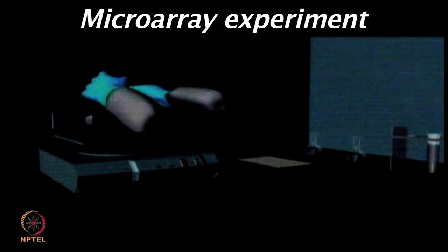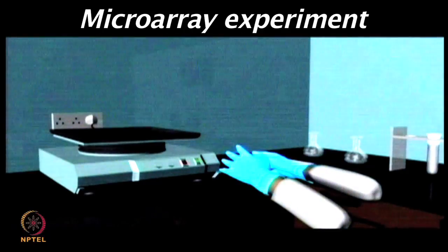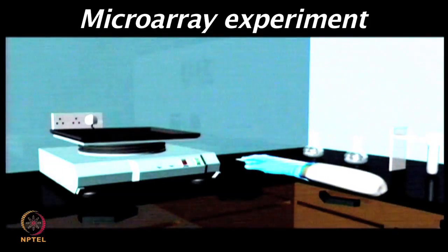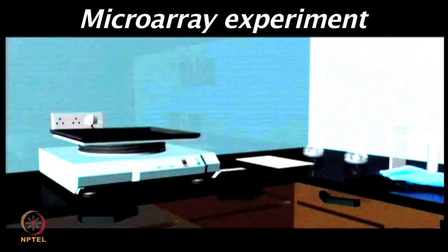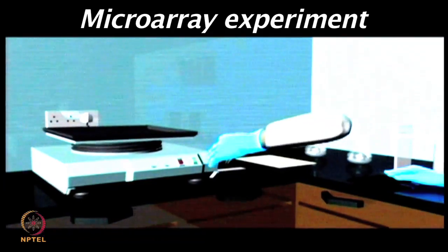Once the primary antibody incubation is done, then you need to do the washing with PBS tween. The washing steps are very important in a microarray experiment.